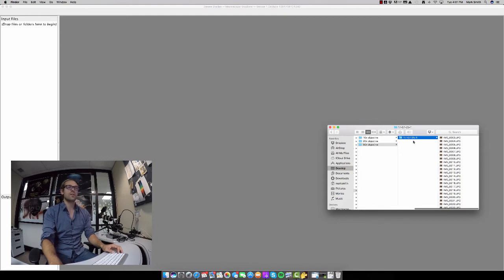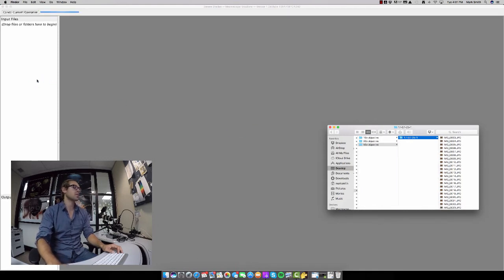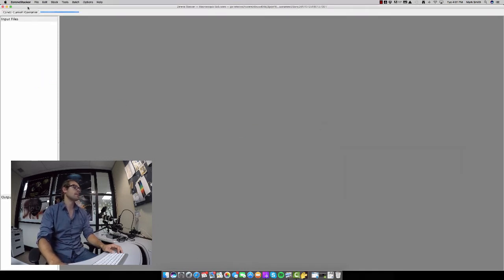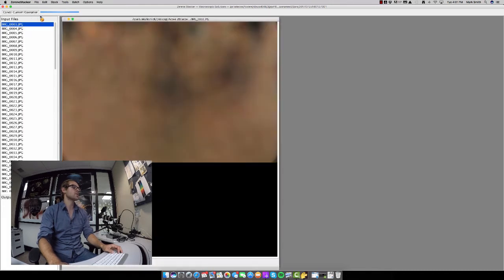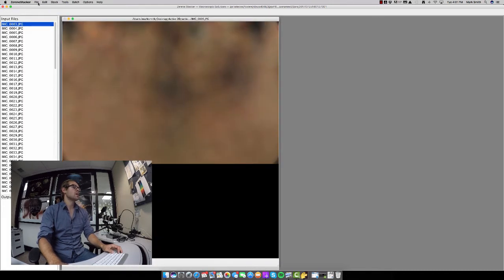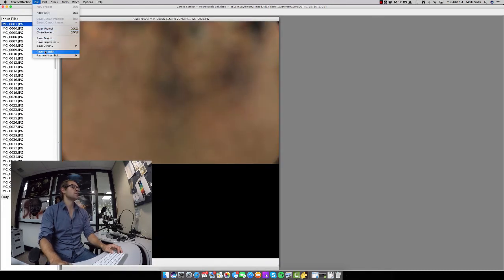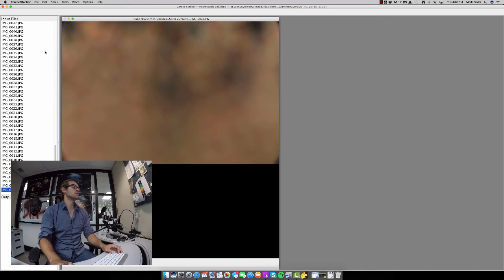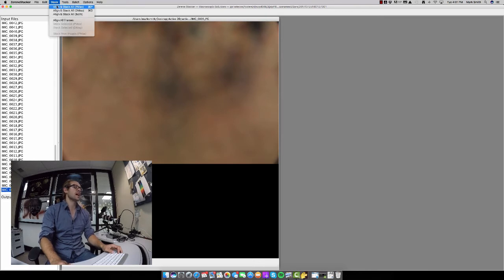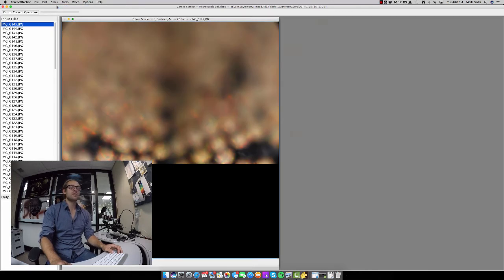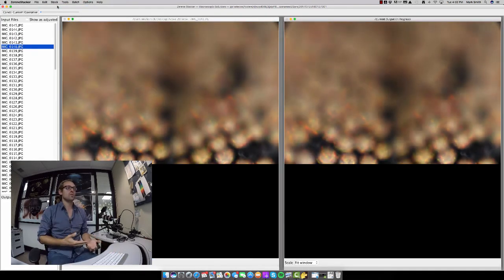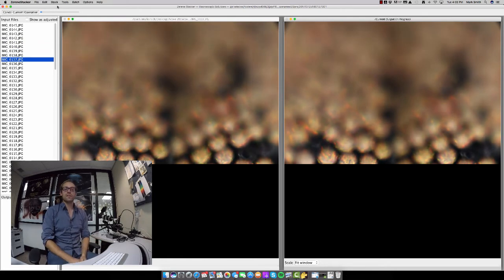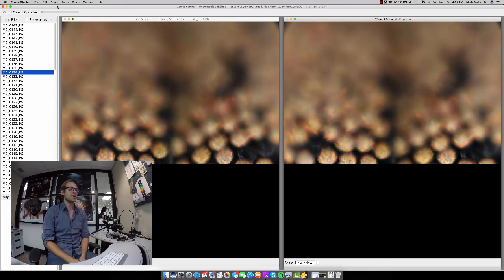We're going to take finder, take where we just captured our images, pull them into input files, and then we're going to go to file reverse order. And then we want to start to stack. This is pretty interesting.